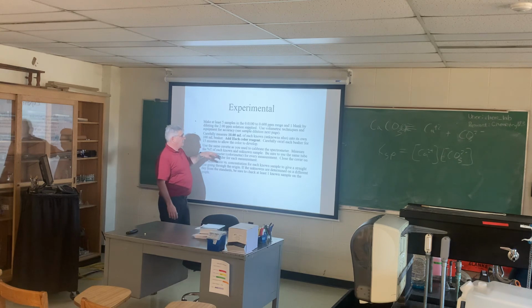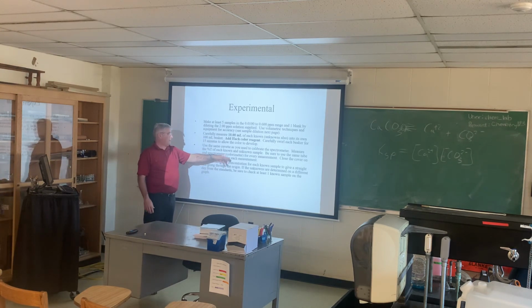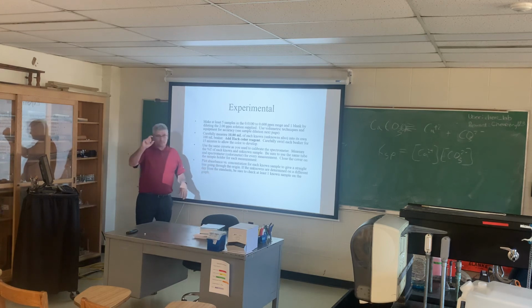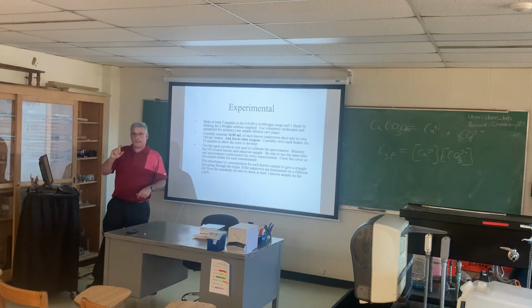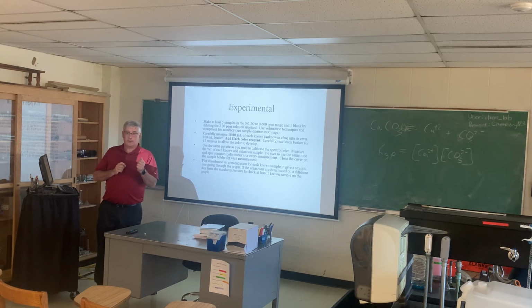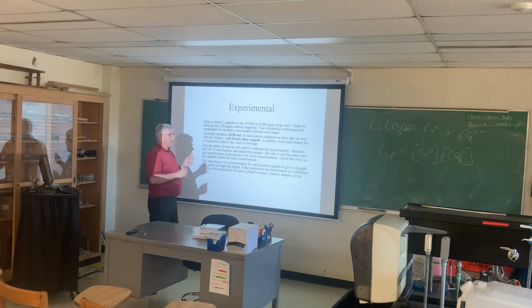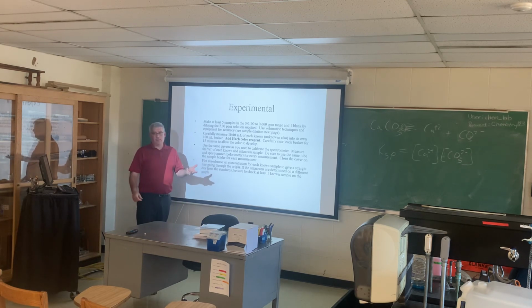You're going to take a cuvette, put an amount of your sample in that, and measure the absorbance of that sample. You're going to measure the absorbance of all of your standards. You're going to build a calibration curve with the standards and then compare your absorbance of the unknown to the absorbance found in the standards. From that, you're going to be able to calculate the amount of phosphate in that unknown sample.